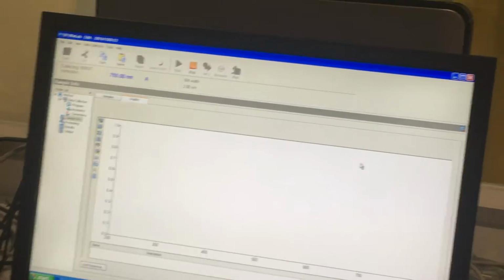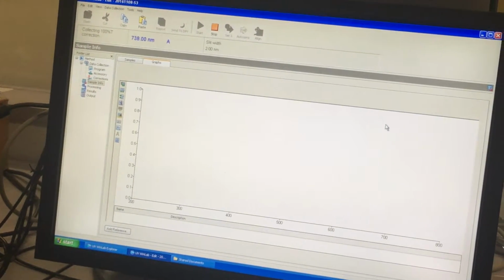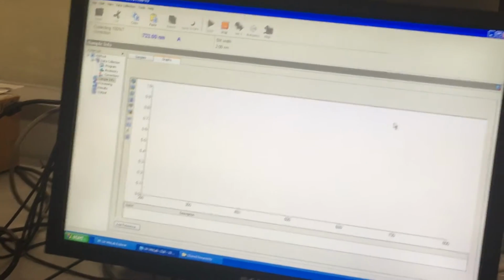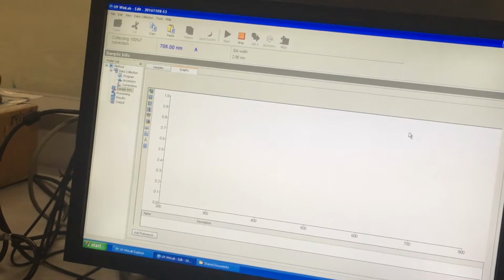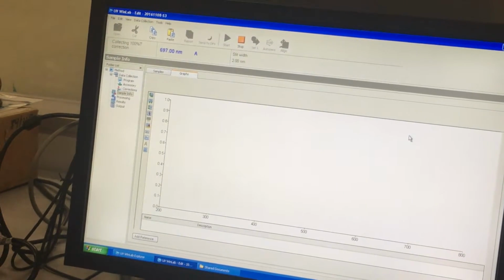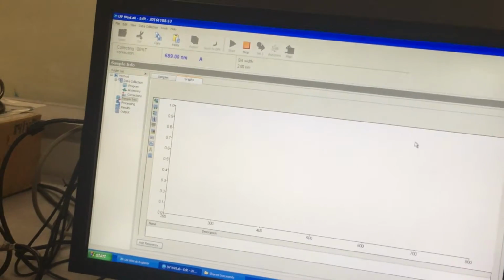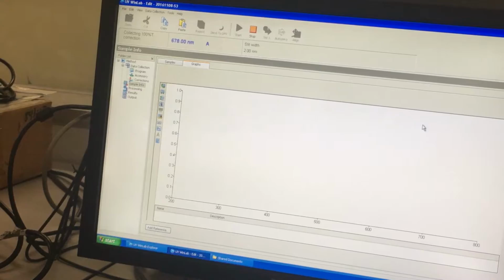Even though it's in the machine? Yes. Because inside it is using a mirror. The mirror is rotating, just slightly only. But a knock or a bang could create vibration that vibrates the mirror itself. Okay. So now just leave it to initialize.